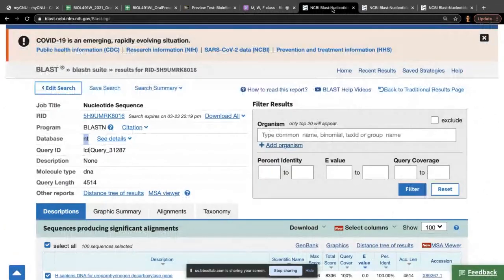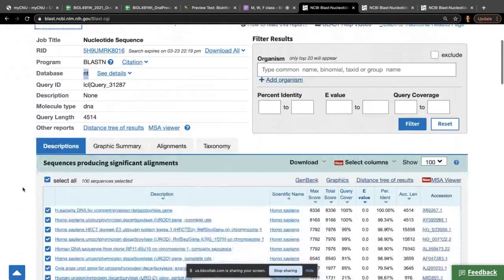We do, you do in sequence. I would do this first one and then look at the results. And if the results are satisfying, then I don't have to look further. Now let's see, how do I know if the results are satisfying?